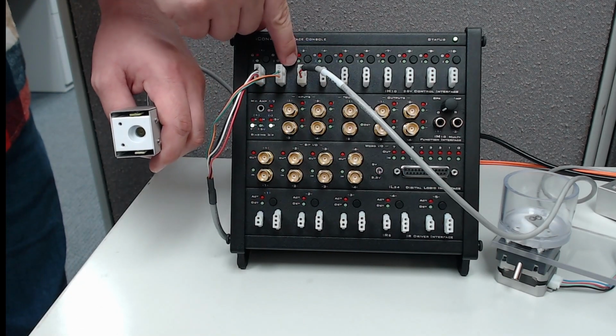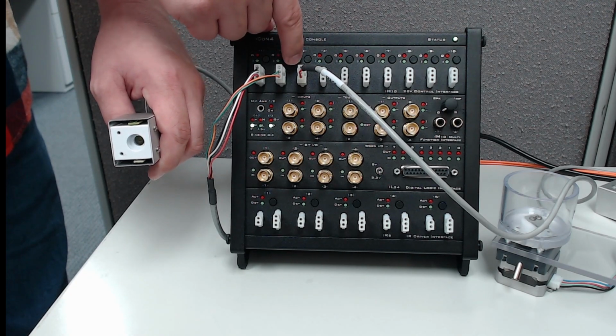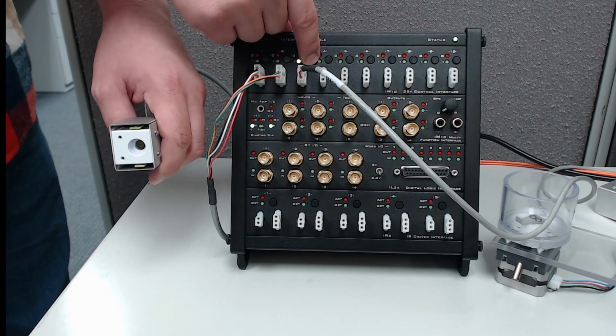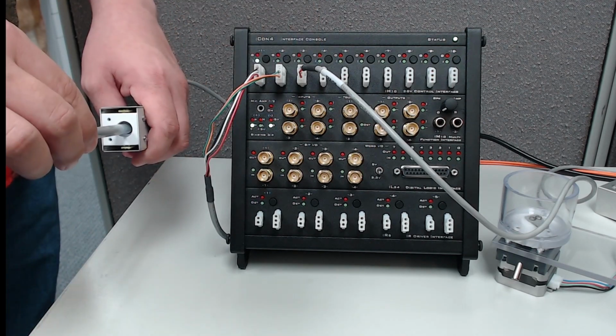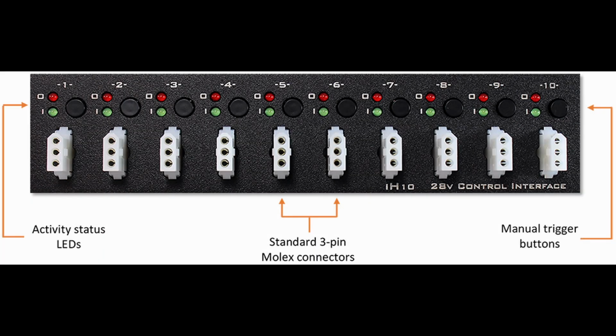When we press the nose poke LED button, we can see the LED light up. When we press the dispenser button, it activates. When we put a pen in the nose poke sensor, you can see the sensor port light up. The LEDs on the bottom row light up when the poke input is true, or when the poke LED or reward buttons are manually pressed. The LEDs on the top row light up when the output is controlled by the RZ from Synapse software.